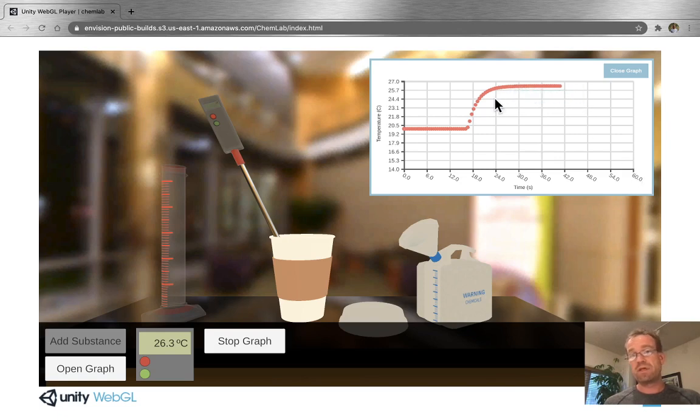Once the graph is level, you want to monitor where the temperature is. I can go ahead and stop it if I want to stop it a bit early. So now I stopped it here. And then I can move my mouse above any of these points to see what values they have. And of course, we're interested in the temperature value, which is the second value.